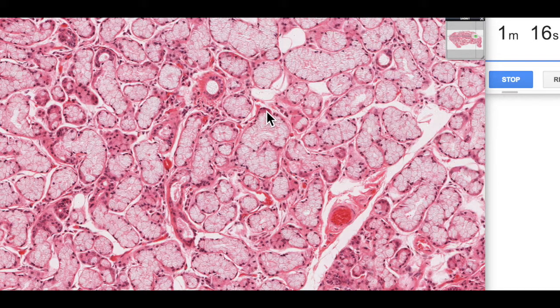So we tend not to have serous acini in the sublingual salivary gland. If serous cells exist, they exist as these serous demilunes. You can see some over here and some other ones over here.